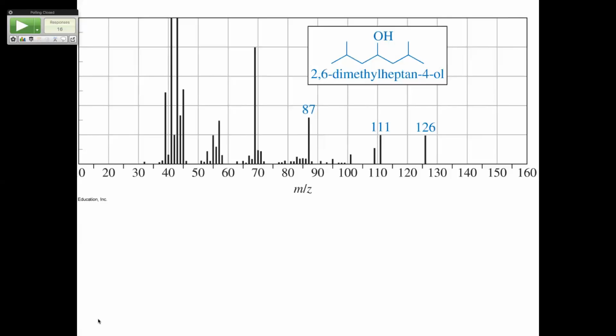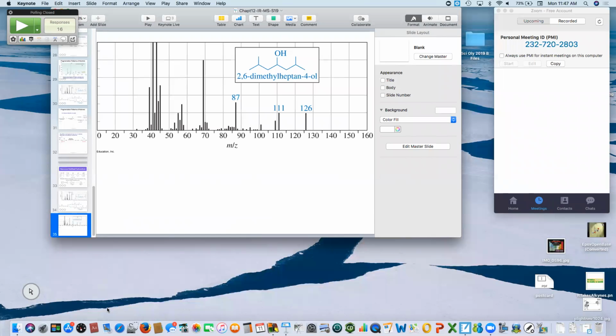See, if you got this, forget there's a hydrogen there. Split it into the carbon to the left over here, and lose the isopropyl. The oxygen should stabilize though, so you should get somewhere. Maybe it's just too branched that it won't do that. I don't know. I'm not going to worry about it. That's mass spec, that's all we're going to do.